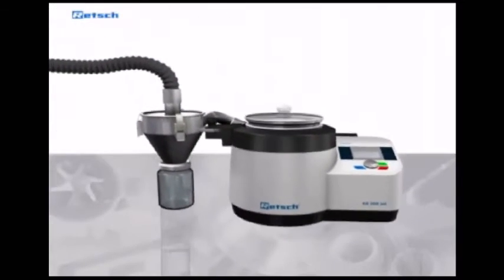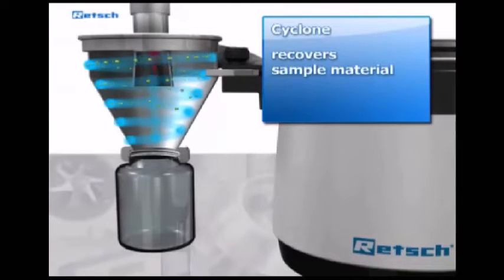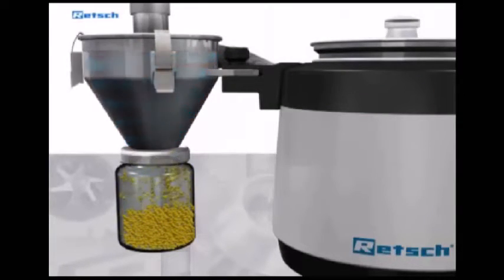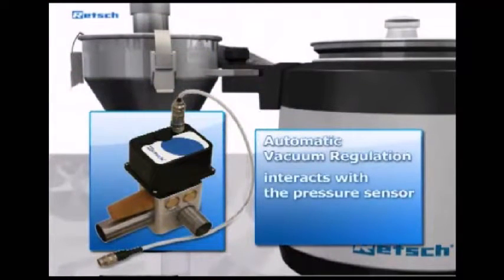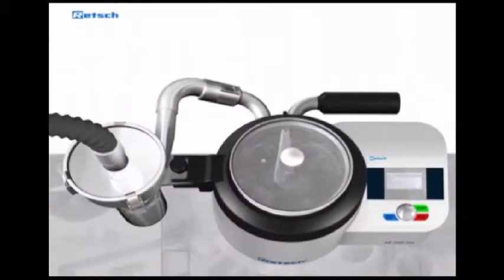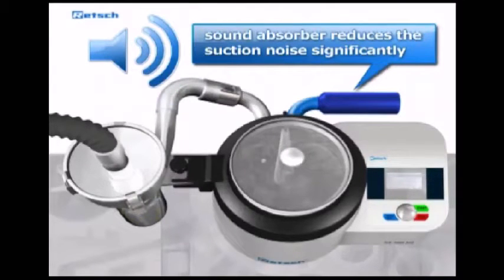The AS200 jet offers a range of useful accessories. If the measured sample material is needed for further analysis, it can be recovered with the help of the optionally available cyclone. It also helps to avoid blockage of the vacuum cleaner filter with fine particles. An automatic vacuum regulation can be connected to the device, which interacts with the pressure sensor, automatically adjusting the airflow to the entered value during the whole sieving process. The supplied sound absorber can be connected to the air inlet channel, which reduces the suction noise significantly.